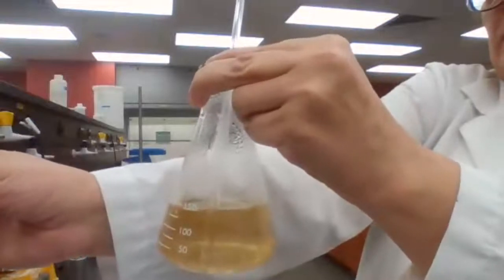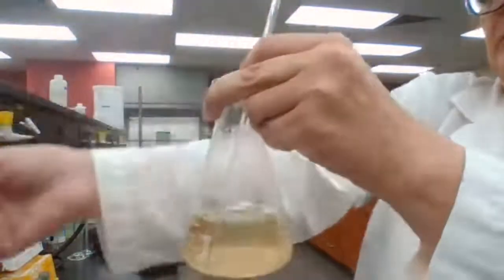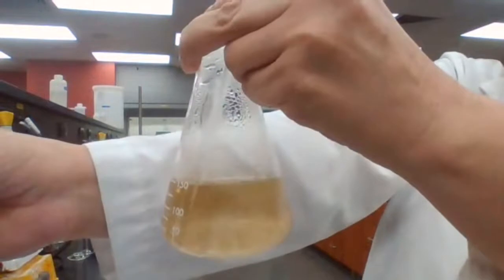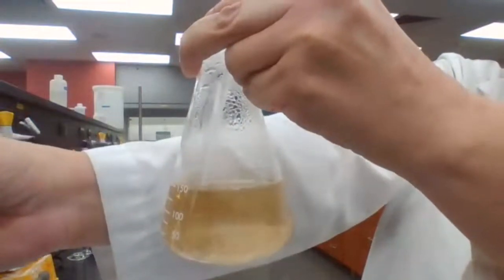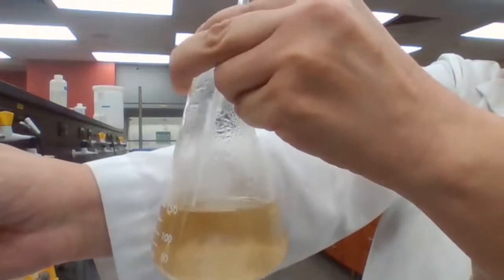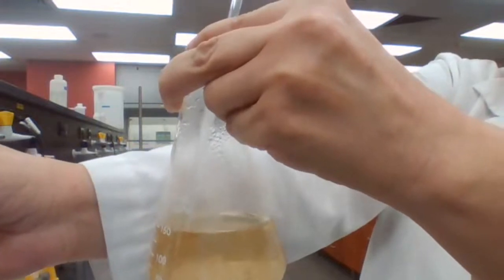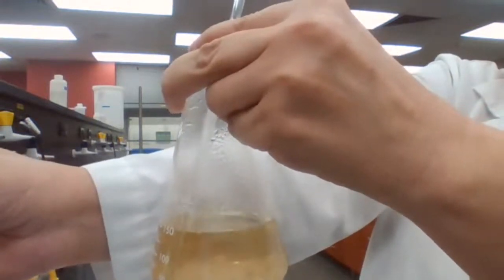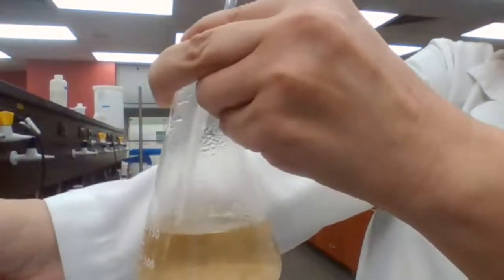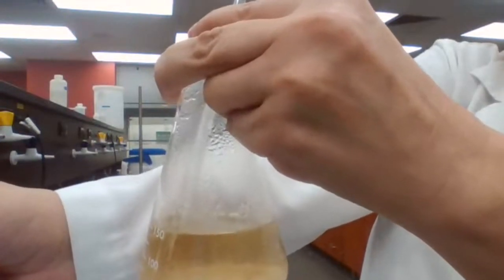So you see those particles that are forming? This is actually a nice screenshot. You could take the screenshot when the particles are coming out of the solution, showing that crystals are forming. We don't have complete crystallization, but the crystals started to form. It is a good time to place it in the ice bath.